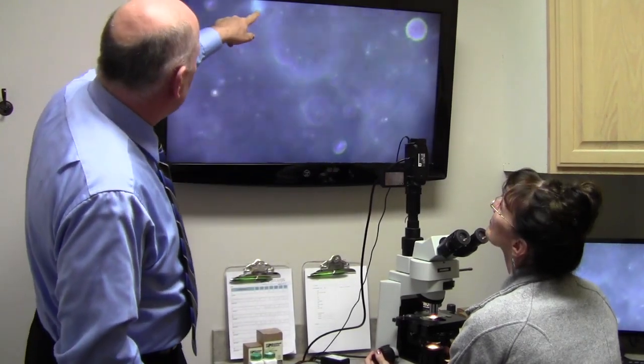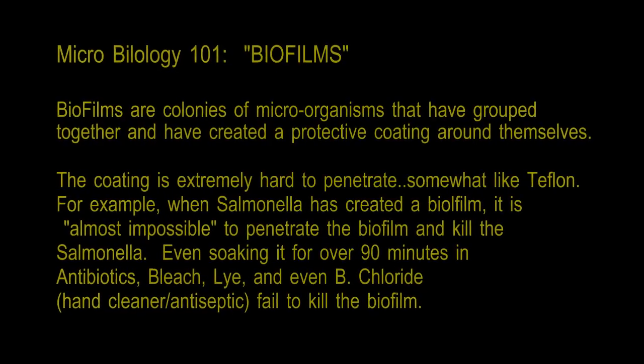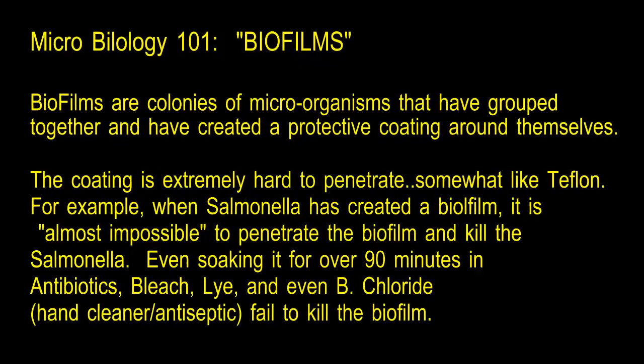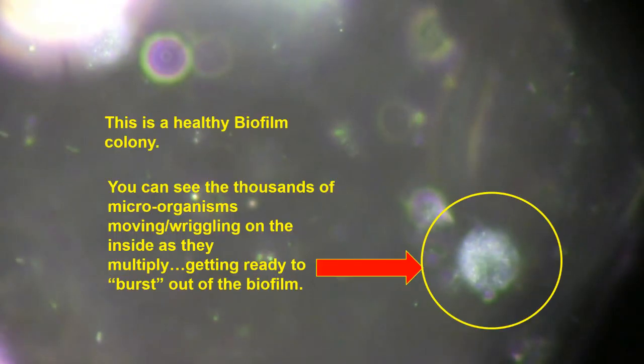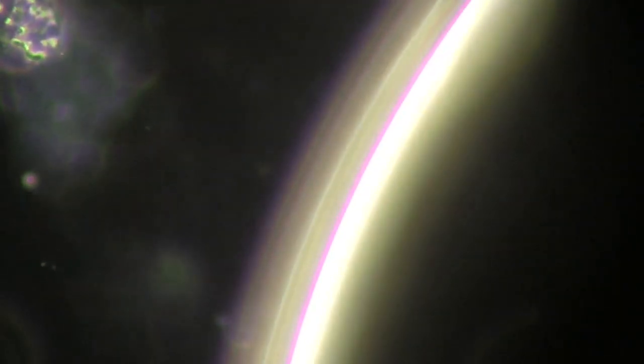Those are tough nuts to crack. Was that another one up there? Yep. There's those ball-y thingies. Yeah, like that one right there. Yeah. Oh, biofilm. Mm-hmm. Yeah, get a biofilm there that's the center of that, and more yeast. There's a good biofilm. There we go. This is yeast right here. Okay.